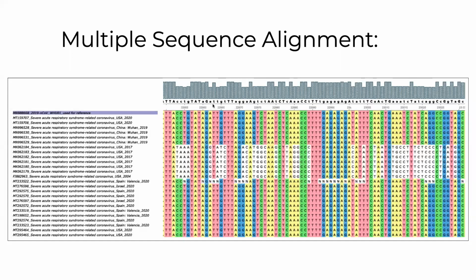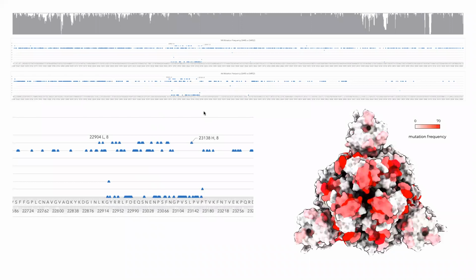But as you can see, this is a very small portion of the full genome. So some other ways that we can look at these differences: we can look at mutation frequency. Mutation frequency tells us how many samples contain a change based on the reference genome. So for example, here you can see that there are some changes. This was the segment that we were looking at in detail. Sometimes the detail is not interesting; we just want to quantify it. And so we can see that 8 out of all the sequences contained this change, and that might give us an insight.